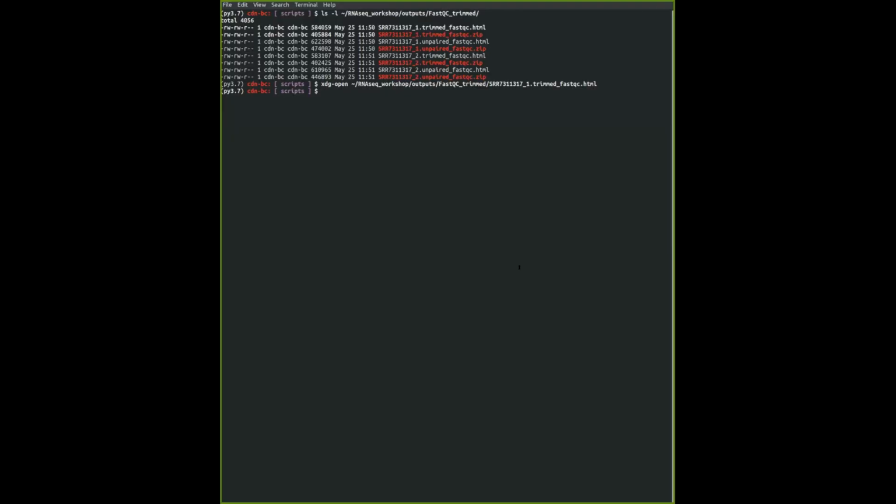So hope you can appreciate the effects of trimming, what happens after trimming. And then we can now begin with the fun part, which is the mapping part. So similarly, we are going to use a script that I have written. So you can go ahead and copy the link to that script on Etherpad. So this is just one script because Kallisto just requires one script to run with the other inputs as your indices, your index, which I hope you have in the right folder.